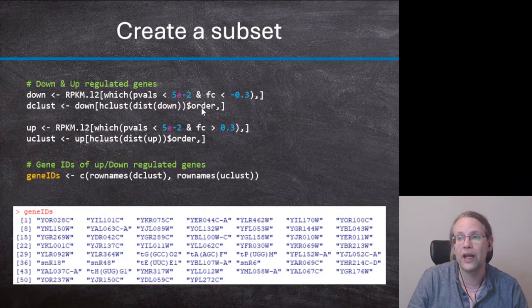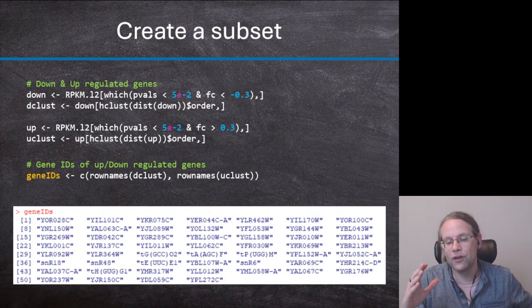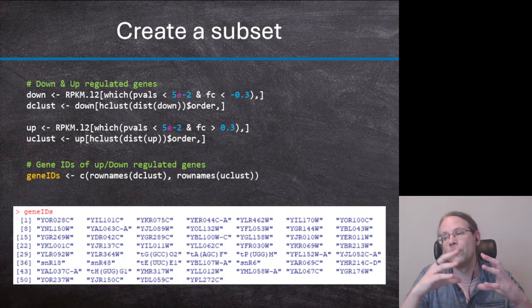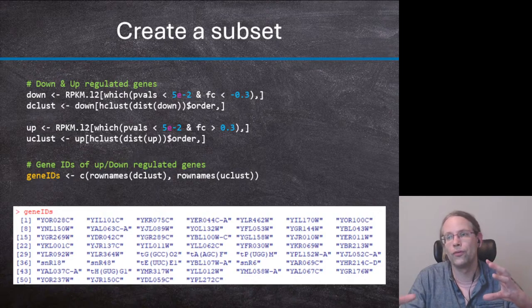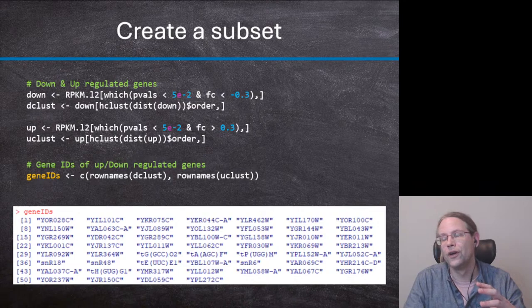And this creates this really nice looking heat map, because otherwise, because you have different groups of genes, you have groups which are downregulated by twofold, downregulated by fourfold, downregulated by 0.5-fold.